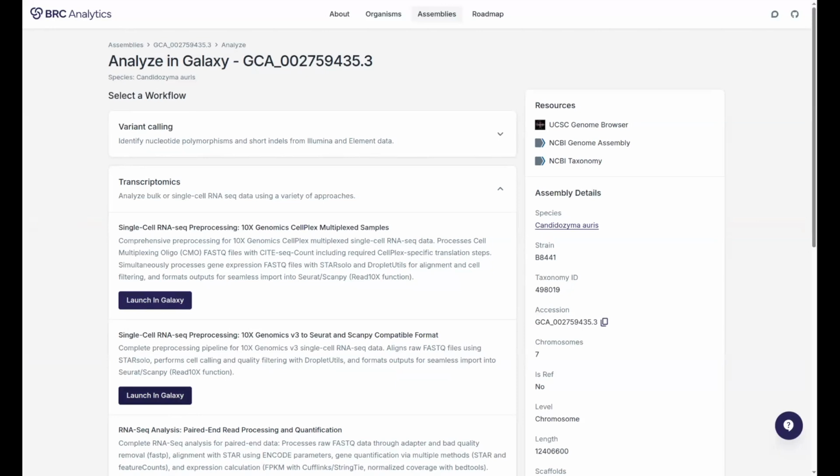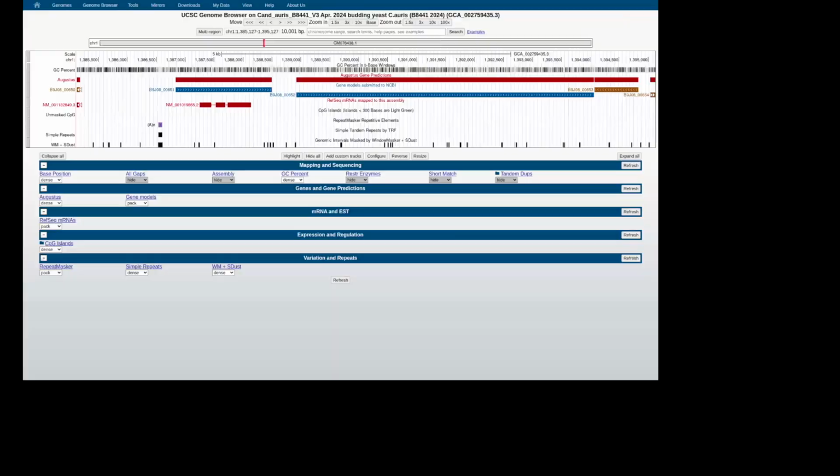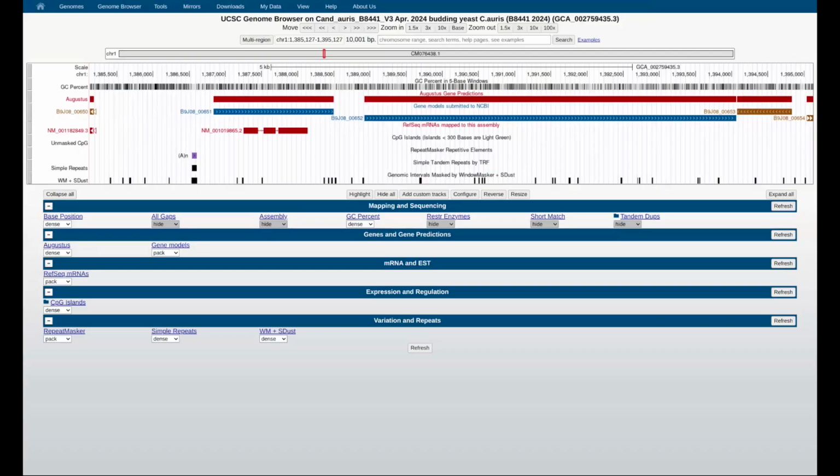So you will be able to look at this data using the browser, and you will also be able to use this data in your analysis. For example, if it's a gene track, you want to run RNA-seq analysis and you want to compute your counts not against, say, the NCBI gene track, but against some custom gene track. So I asked Peter to unmute if he wanted to elaborate or comment on that.